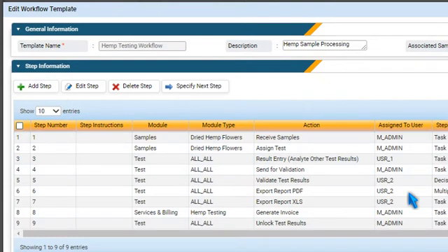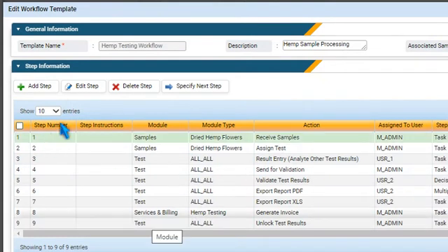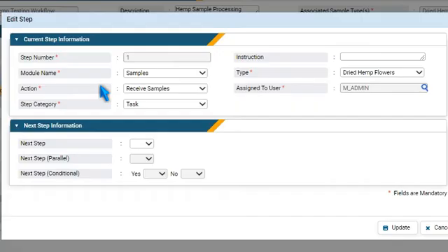To edit a step, select it and press Edit Step. Make the required changes and press Update.